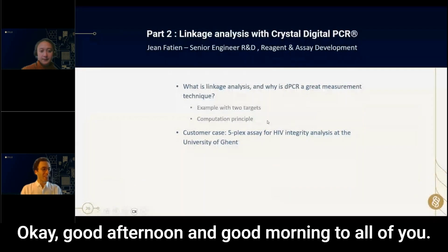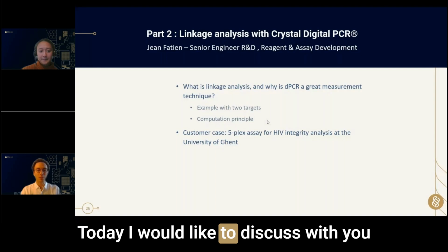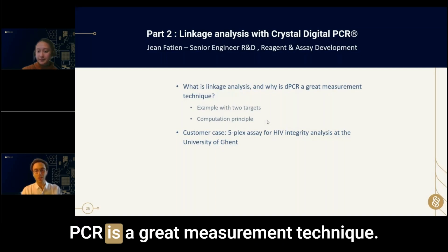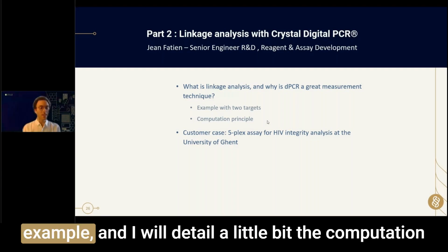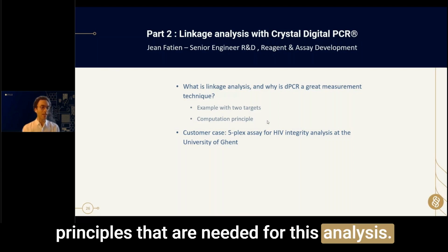Okay. Good afternoon and good morning to all of you. Thank you very much for being here with us. Today, I would like to discuss with you what is linkage analysis and why digital PCR is a great measurement technique. And to do so, I will start with a two-target, two-color example, and I will detail a little bit the computation principles that are needed for this analysis.